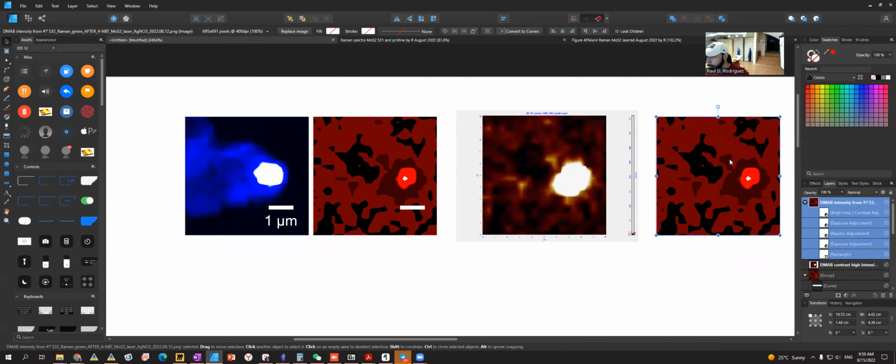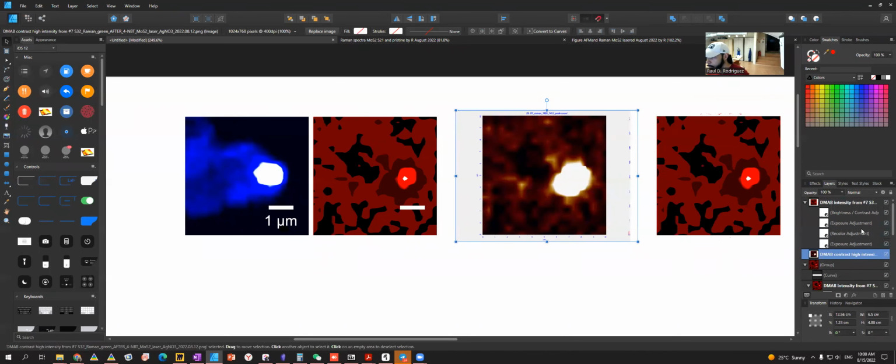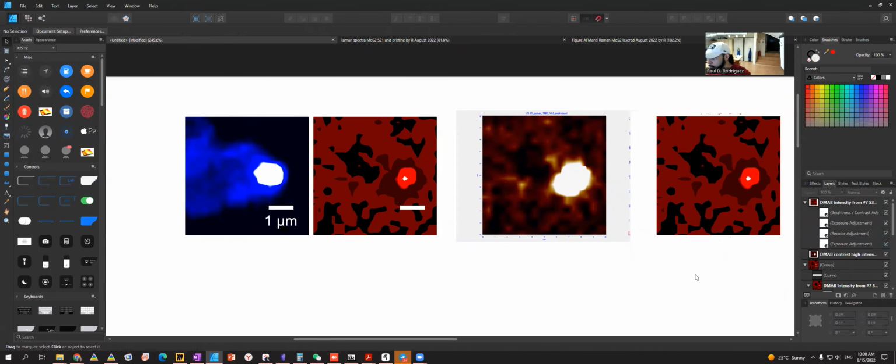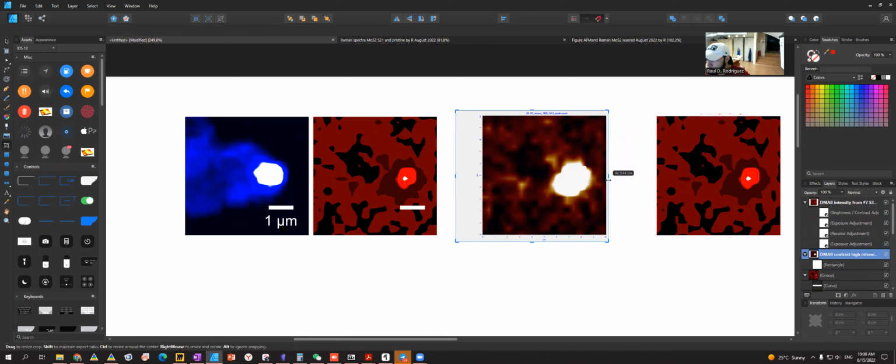Although this is the one I want to use. For some reason this keyword is not there, because I took it out. So what do we do? You start moving things to this one. It didn't do it. Let me see what happened there. I never tried that one before, but I don't know why it's not working. Okay, never mind.